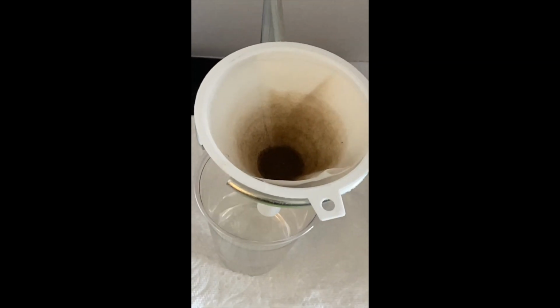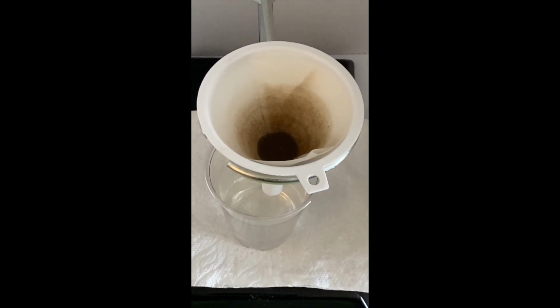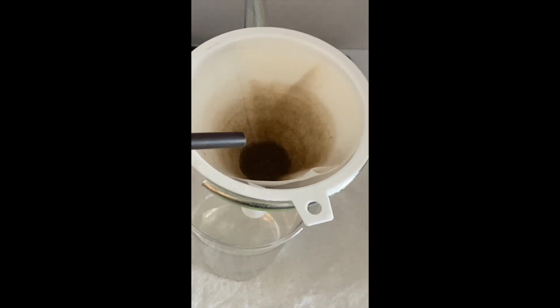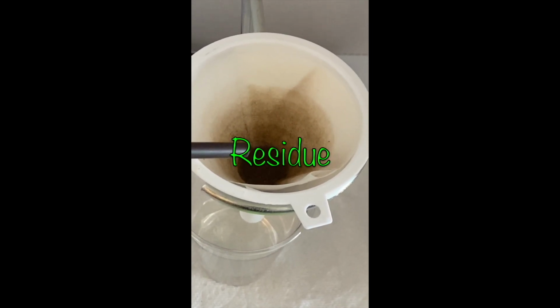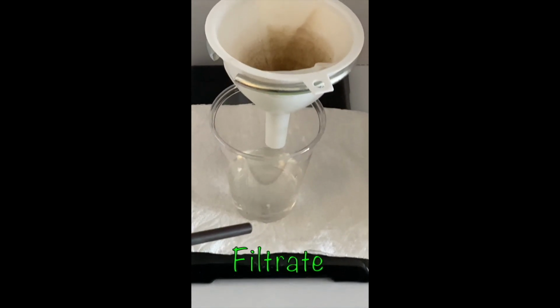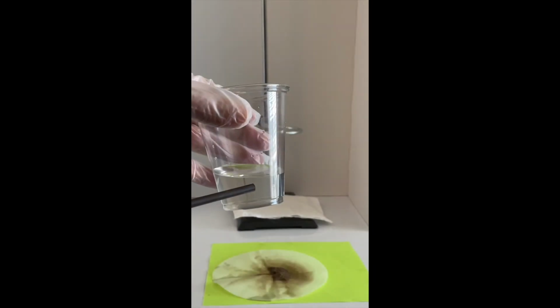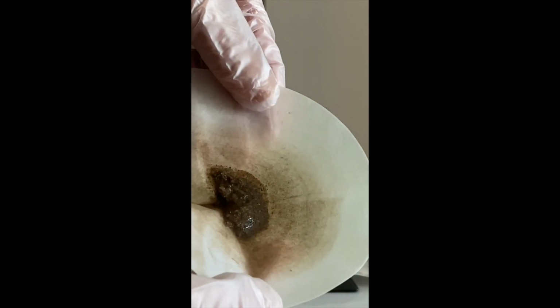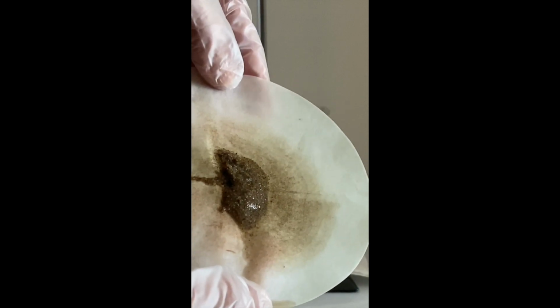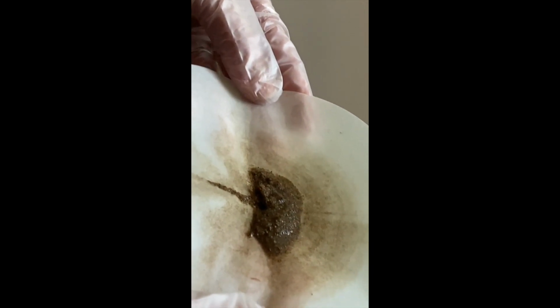Eventually, all the water has been filtered out and the dirt particles are trapped in the filter paper. The solid or sand particles collected in the filter paper is called the residue, while the liquid that passes through the filter paper is called the filtrate. Unlike the filtrate, the residue does not pass through the filter paper because the solid particles are too large to get through the tiny pores or holes of the filter paper.